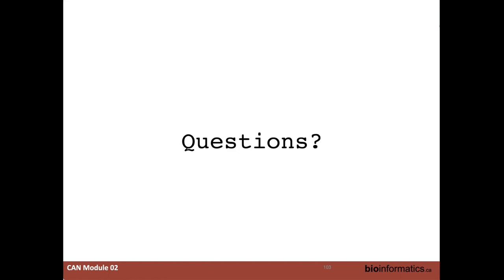And do we address that in the analysis part, or do we ever address that? So there's two parts to this one. Again, it depends on what you've been given. Some groups are set up so that they'll just give you the BAM file. We did the analysis for you, here you go. And you could see that there's different versions being used. Right at that point, I always ask them, give me the raw data, let me do this myself. That's just me, just happens the way I work.